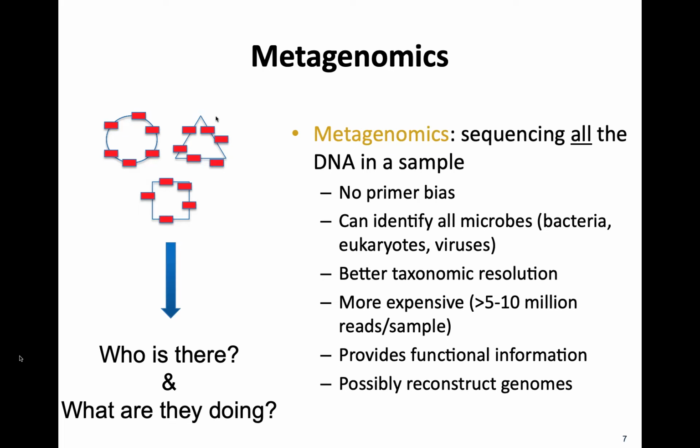There's been a bit of success on the other side, where people will try to remove microbial DNA to do human sequencing, and they work fairly well there. But the biggest problem is we do worry about biases with the microbiome.